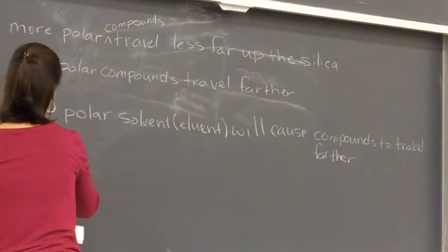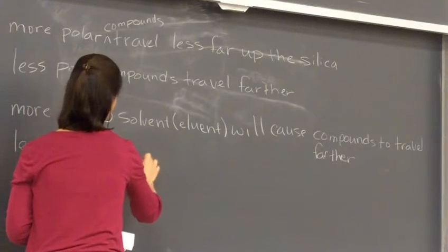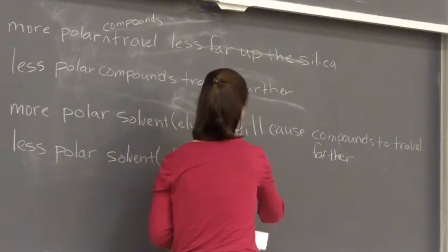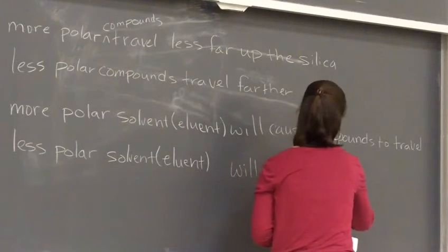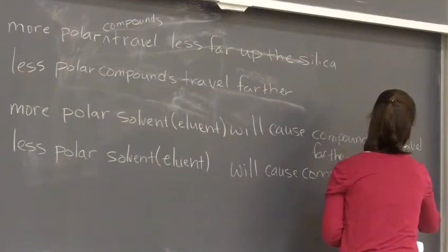A less polar solvent will cause the compounds to travel less far.